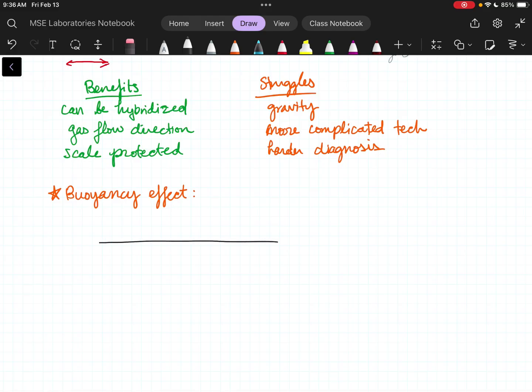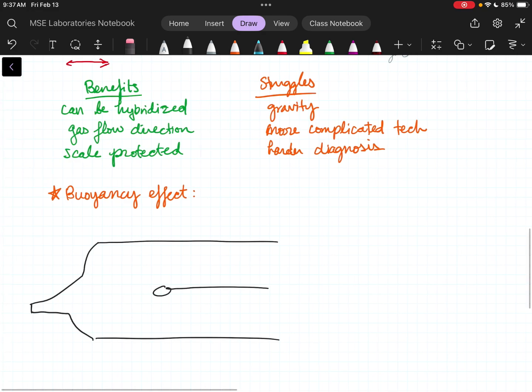So this weight actually can move, on our instrument anyway, the weight can move out and in to balance this side. And then there's also a chip that you can move up and down to reach that kind of balance point. Those kinds of things they build in to be very user accessible, because they know this balance is so sensitive that we are going to need to check it and recheck it and recheck it, and we don't want to get a technician in every single time we have to do that.